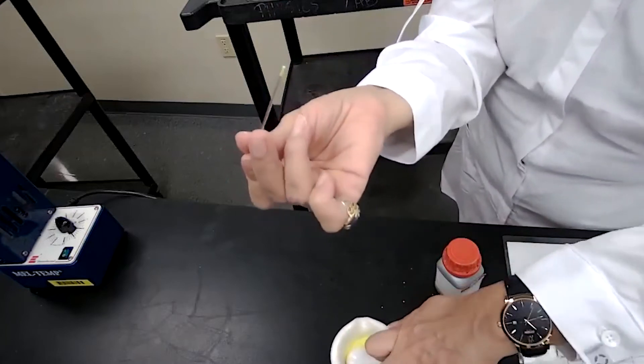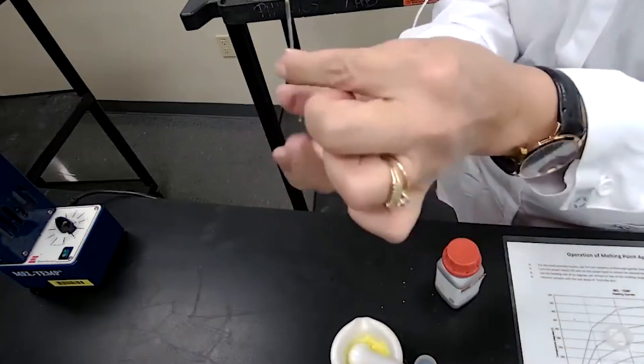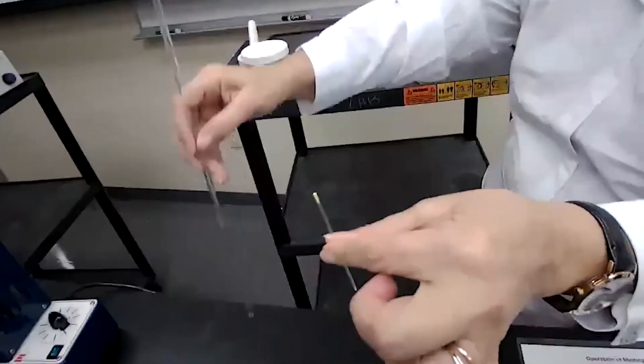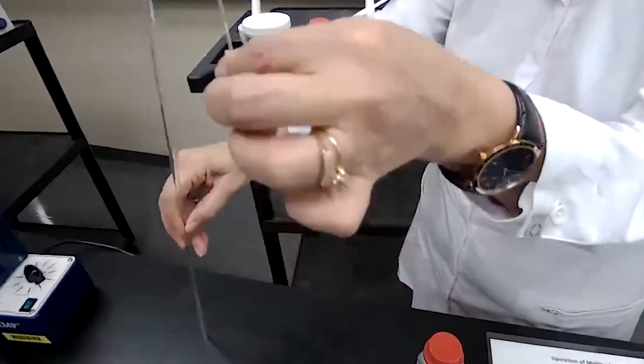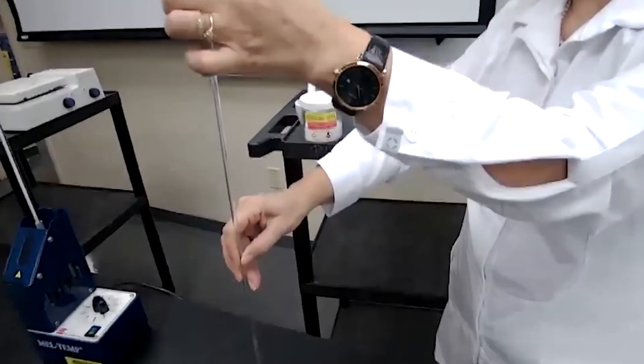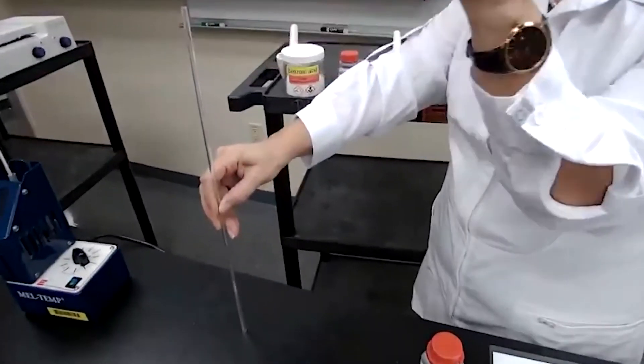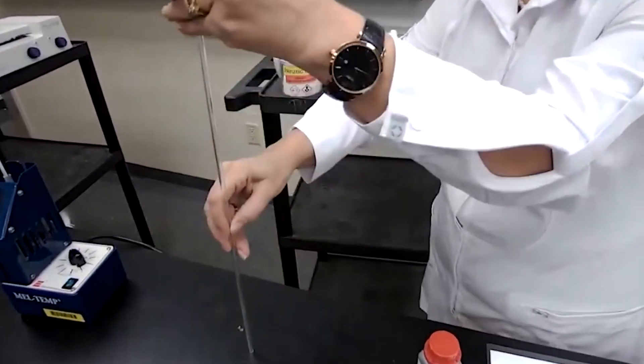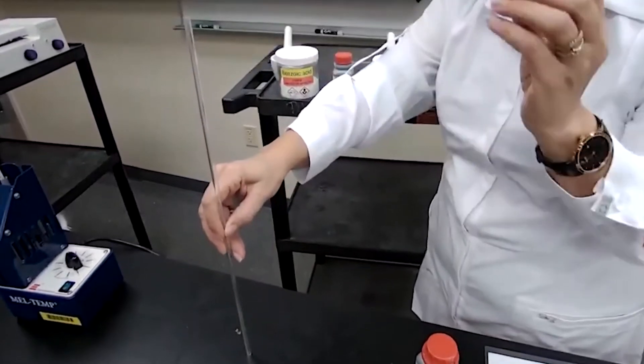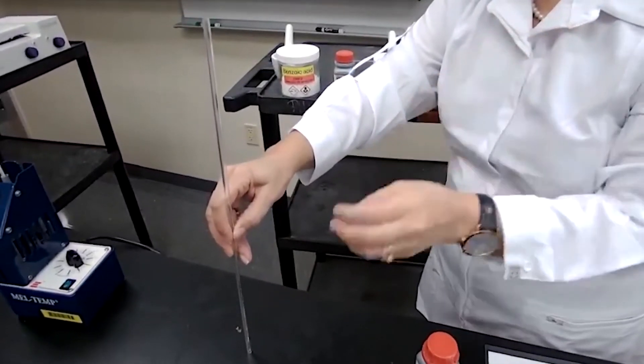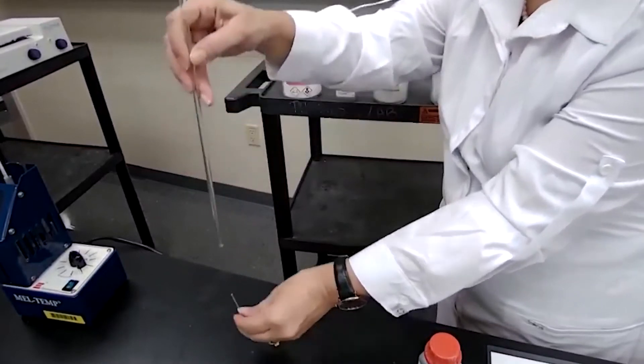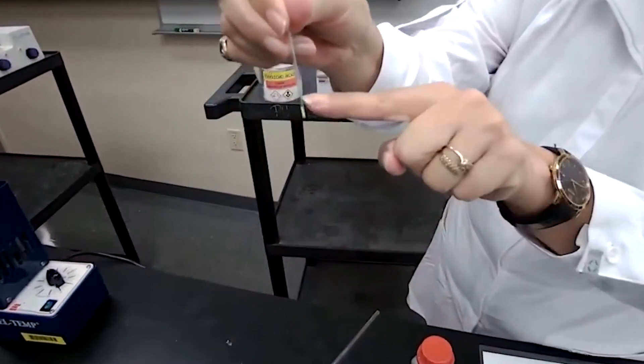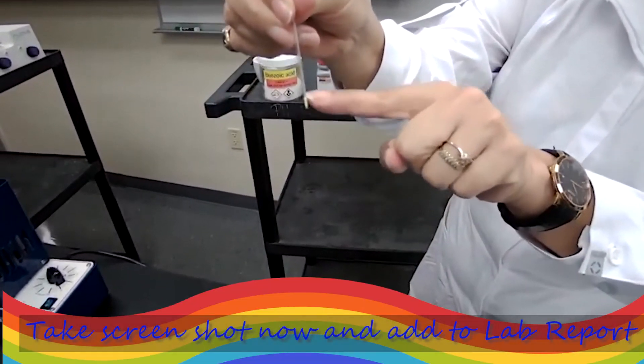Now we need to transfer the sample from the tip of capillary tube to the bottom of capillary tube. To do that, I'm going to use a hollow glass tube and drop the capillary tube through that hollow glass tube. Do that a couple of times and make sure the sample is all the way down and properly packed.